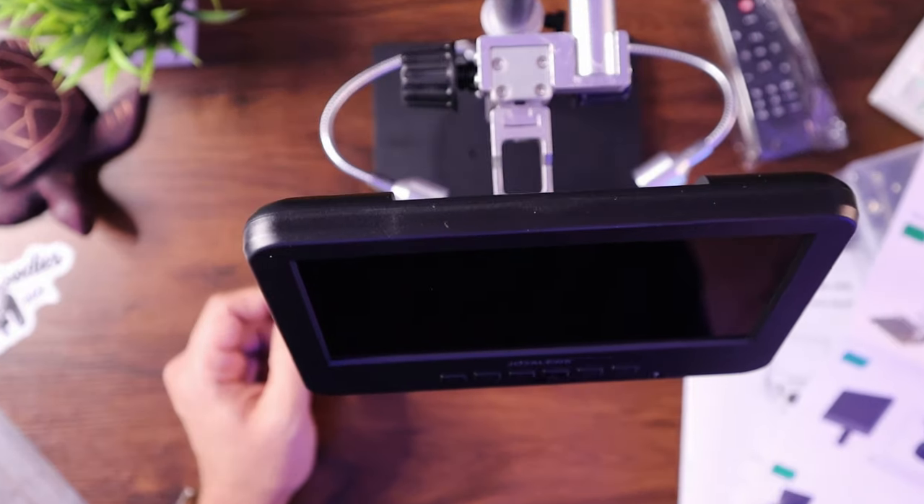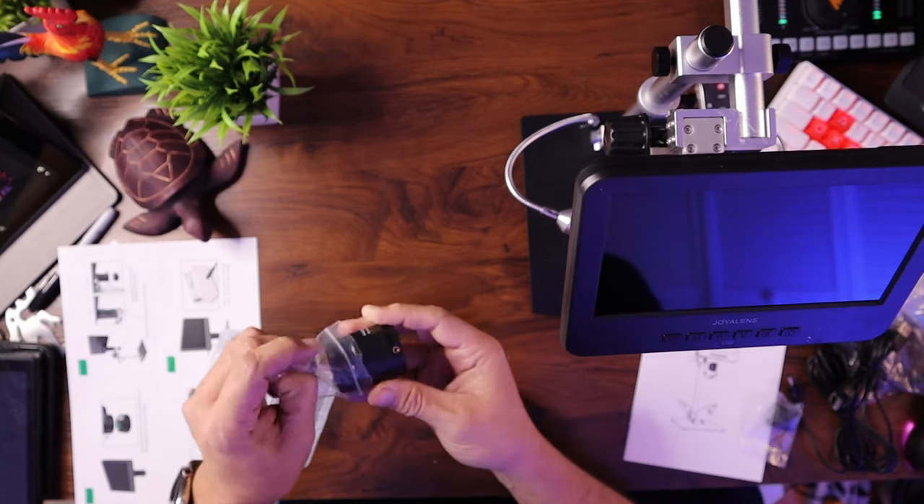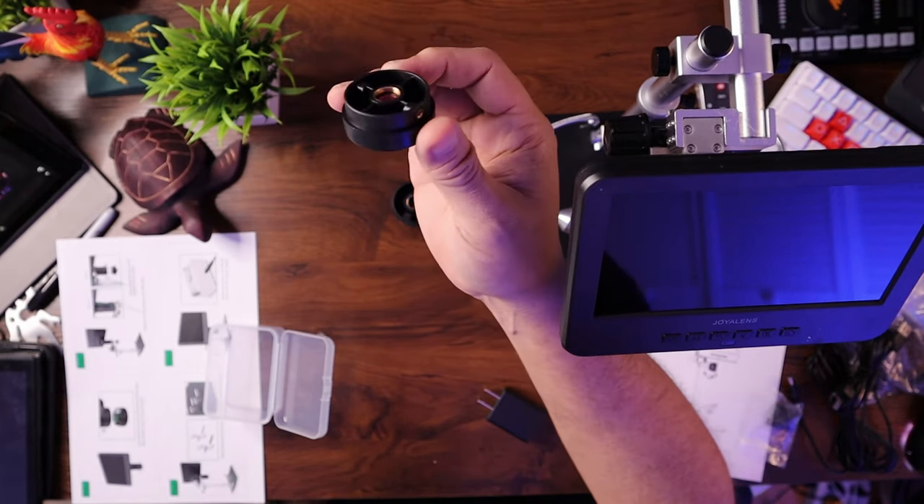There are two screws in the back that we use to tighten that on. Once it's seated, we can go ahead and tighten it up and then put the lens back on. There are two metal clips that go here to hold specimens in place. It's got two different lenses: one with an object distance of 90 to 300 millimeters — the bigger lens — and the smaller lens with an optical object distance of four to five millimeters.